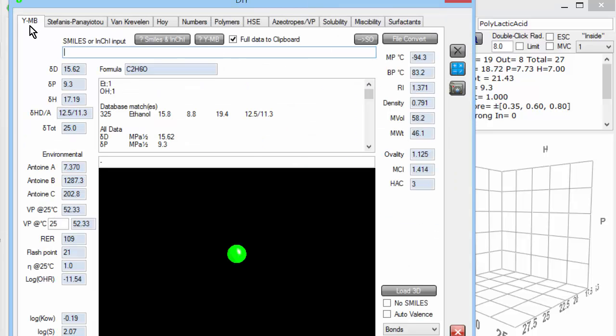It's called the YMB system, Yamamoto molecular breaking, after my colleague Dr. Hiroshi Yamamoto, who created the scheme. And basically, all you do is you type in a SMILES string, CCO, two carbons and an oxygen, that means ethanol.